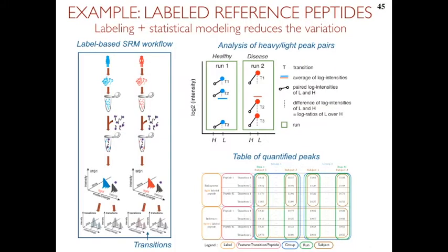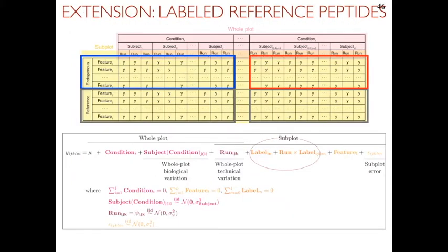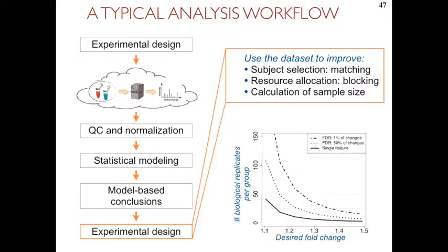I will skip that for time, but essentially we can extend this to labeled workflows. Remember, I was saying last week that what we're doing is comparing deviations from the labeled references among the blue dots and among the red dots. Since the deviations are larger, it points to the fact that the red group is upregulated compared to the blue group. And so we can generalize this within the same approaches and same data structure in MSstats. It just extends our table a little bit. I will have to skip it for time, but come to me during the break. I'm happy to tell you more about that.